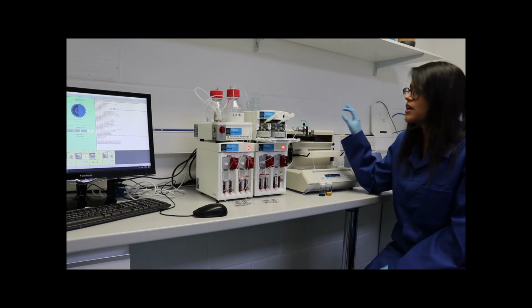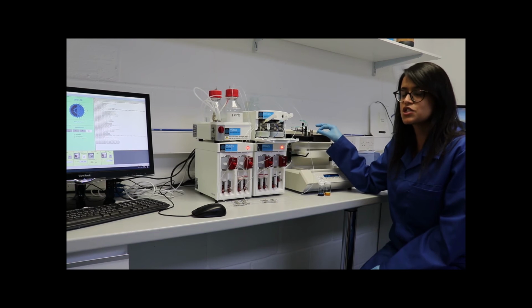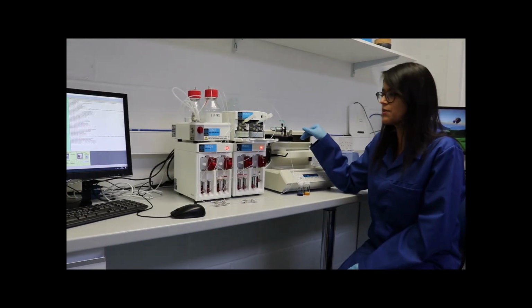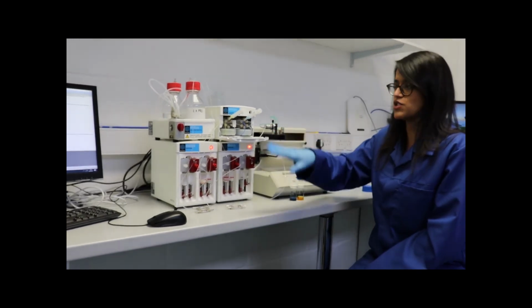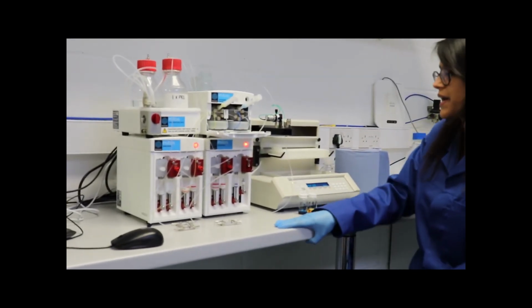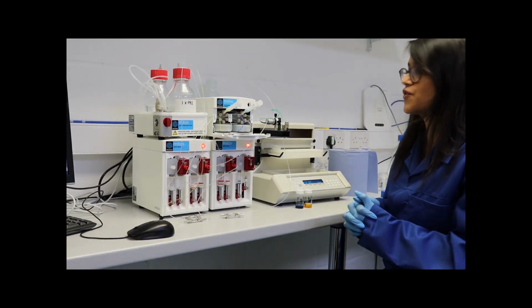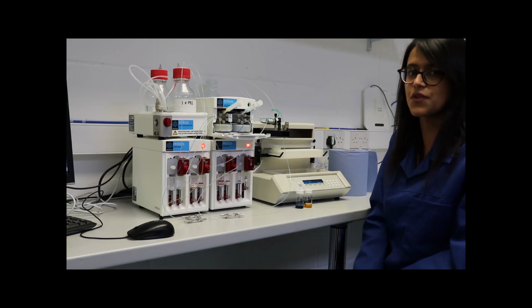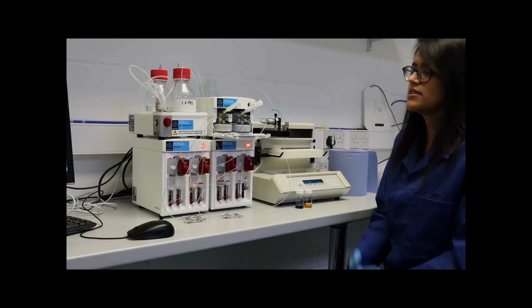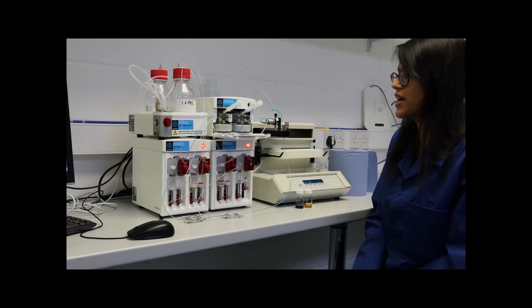So again, the Gilson, the automated collector, has moved to the second position to start collecting the second experiment, and the dye will eventually start releasing and go through the chip again. So that was a pretty short cycle for the first experiment. It took us a couple of minutes, in fact even less than 3 minutes. And some of that depends on how quickly you sometimes load your sample into the ASV as well.